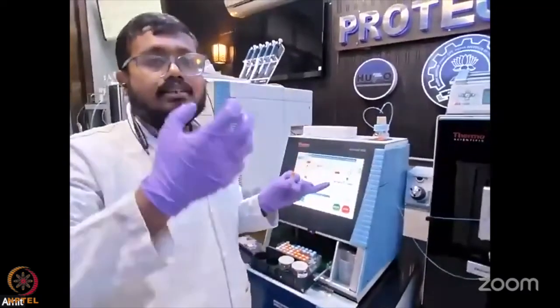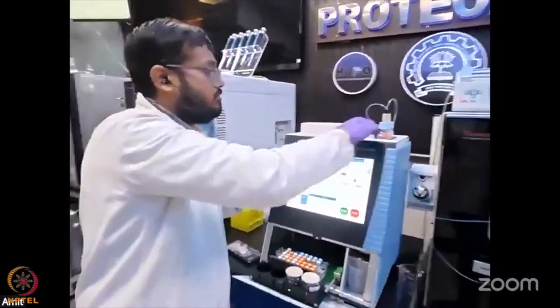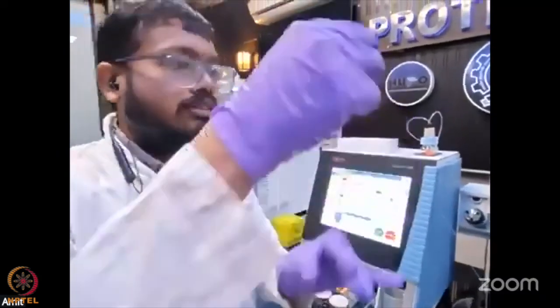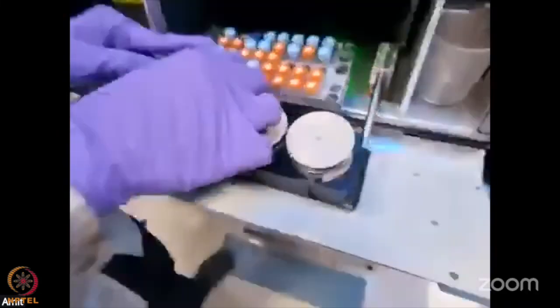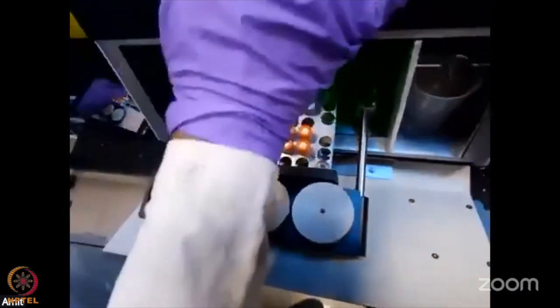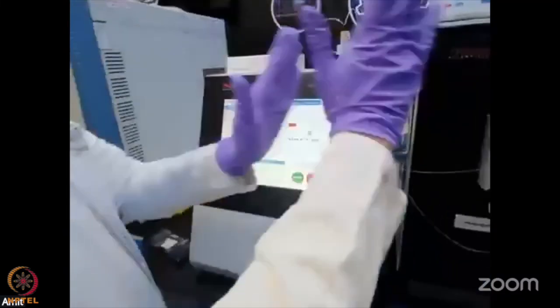Here we are taking another peptide characteristic, hydrophobicity, to be used, and these two solvent systems in the chromatography help to create the gradient by which the peptides get eluted out. So the samples that we bring, we put them in the auto sampler, and then we just eject the tray.